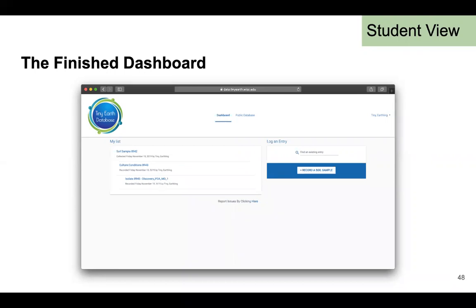So Olivia just asked about past data. Two things. We're working on this: if you previously had your students enter data through either the old Small World database, or through the Qualtrics entry that I created one semester that could mimic that for adding data, I think it was in fall of 2018, we're working on doing a batch upload of that.